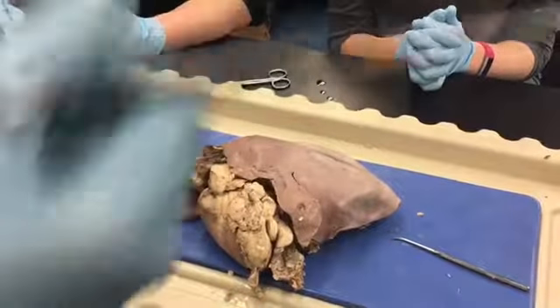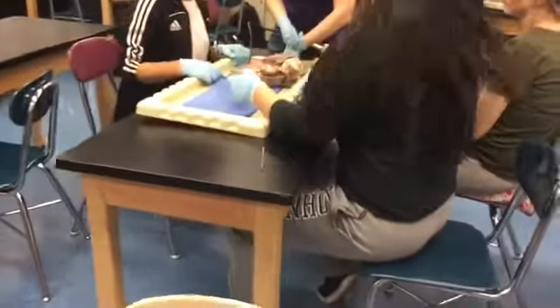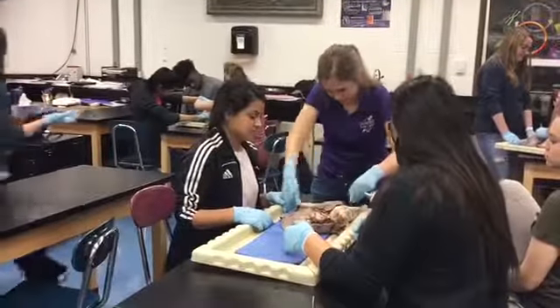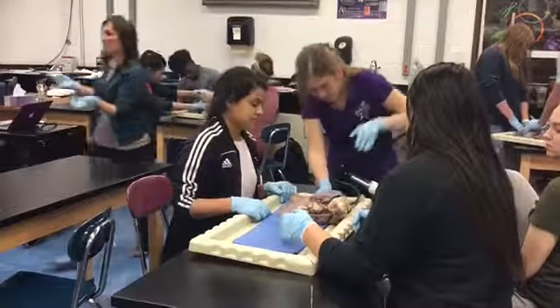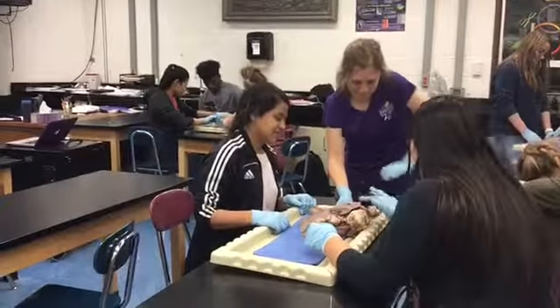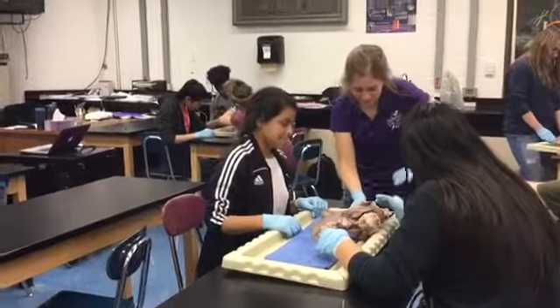Get a videotape of the class and what Miss Fred is doing. She is inflating the lung. It's not inflating all of it. Yeah. That's pretty good.